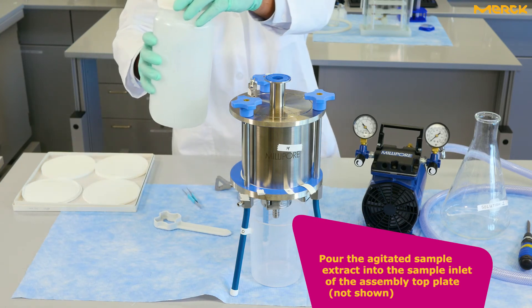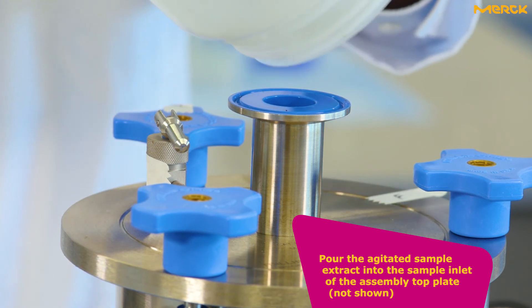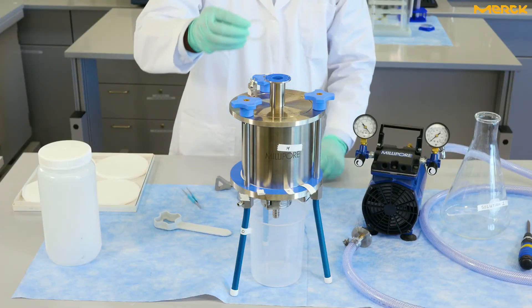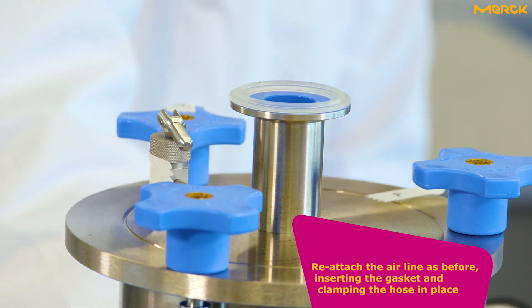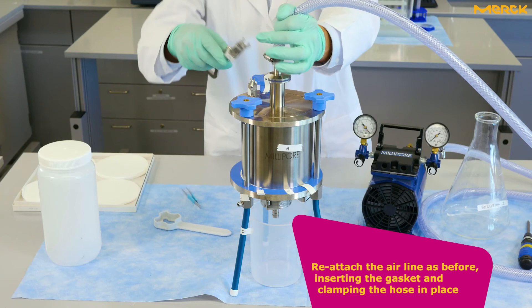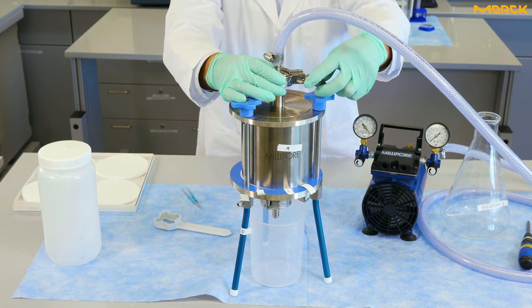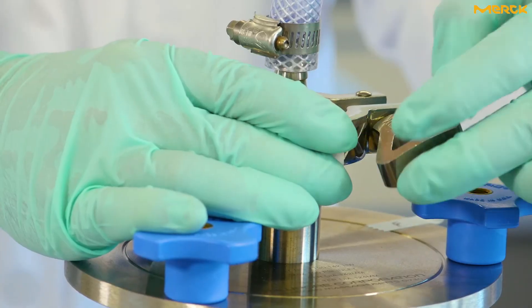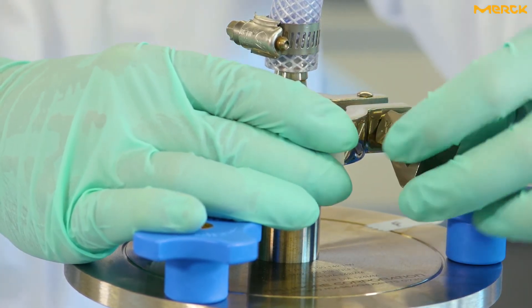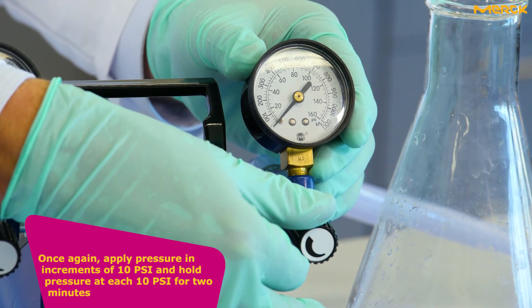Pour the agitated sample extract into the sample inlet of the assembly top plate. Reattach the airline as before, inserting the gasket and clamping the hose in place. Once again, apply pressure in increments of 10 psi and hold pressure at each 10 psi increment for two minutes.